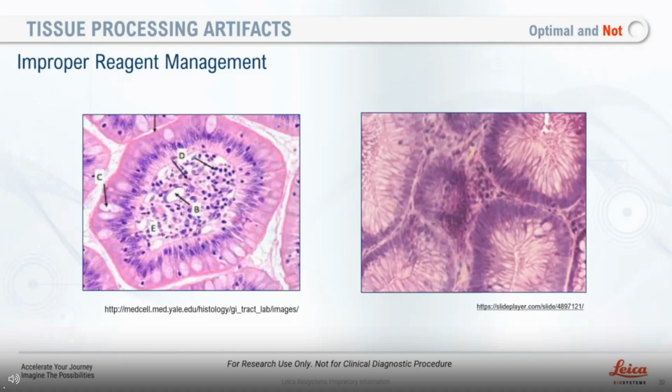Good question. This is not present on all processors, right? But there are some instruments out there that do require water flush.